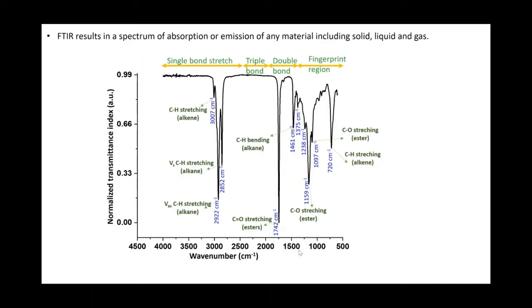To recognize a new material or your sample, the unknown IR spectrum or IR absorption spectrum is usually compared with the standard spectra of a known material. So the match of the spectra helps in the identification of the constituents which are present in the sample.